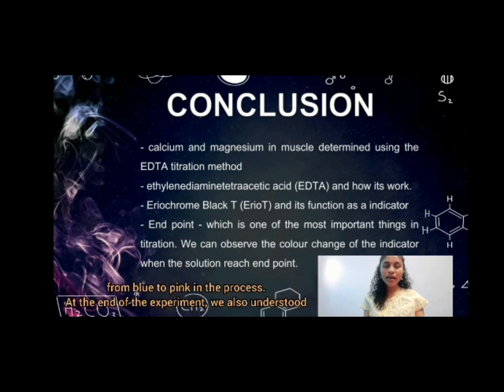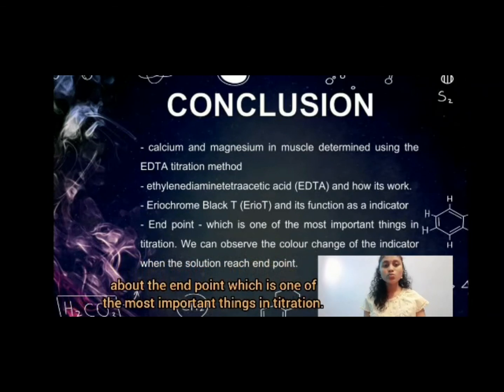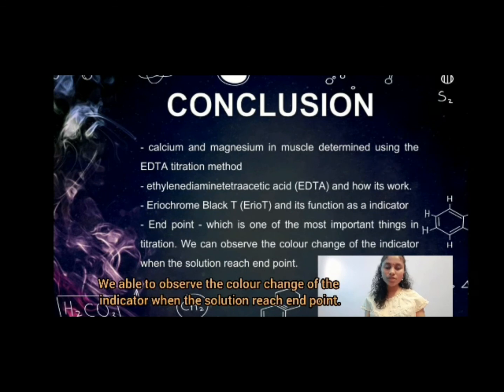At the end of the experiment, we also understood about the endpoint, which is one of the most important things in titration. We are able to observe the color change of the indicator when the solution reaches the endpoint.